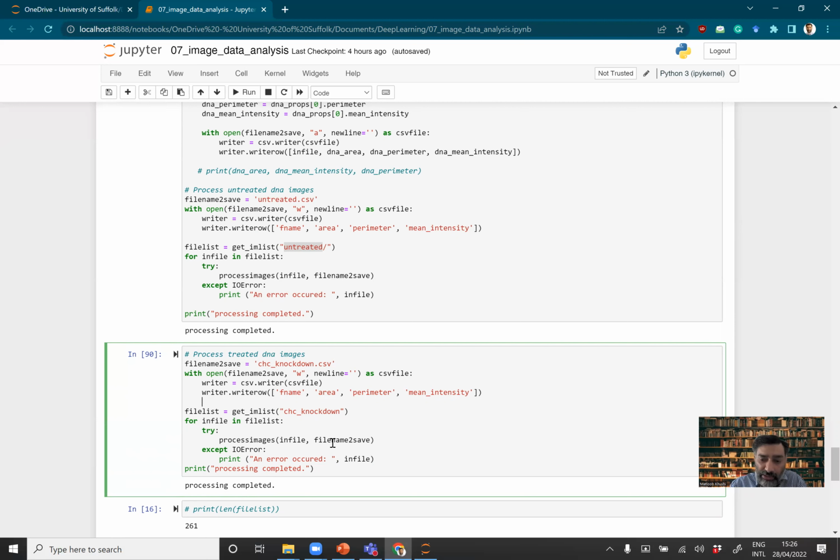Unless you give this information to your authorities, to your researchers, that this is untreated and this is treated, and why: because the size has gone bigger or smaller, the parameters have changed, its shape has been compromised, it has decomposed, or whatever. Then it's meaningful information. And you also apply statistical analysis on top of it to give it more meaningful reasoning.